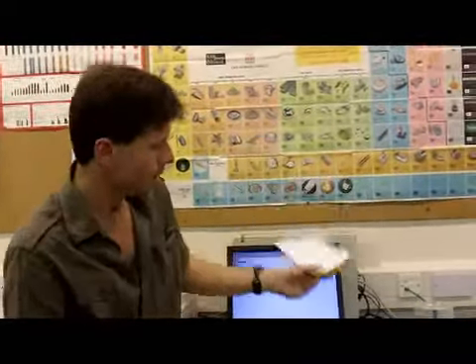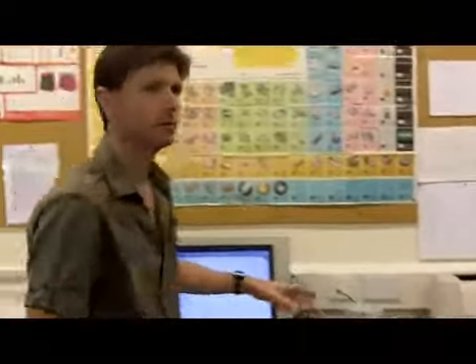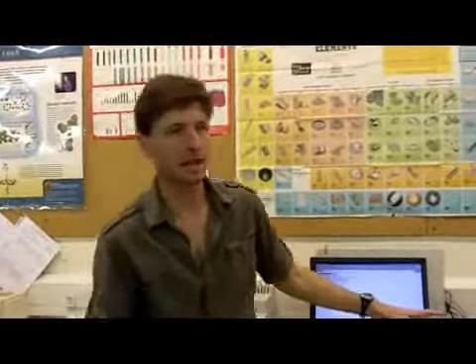Right. The data is saved as an Excel file, so you can call it up in Excel and use Excel to measure those peaks and display them for your report.